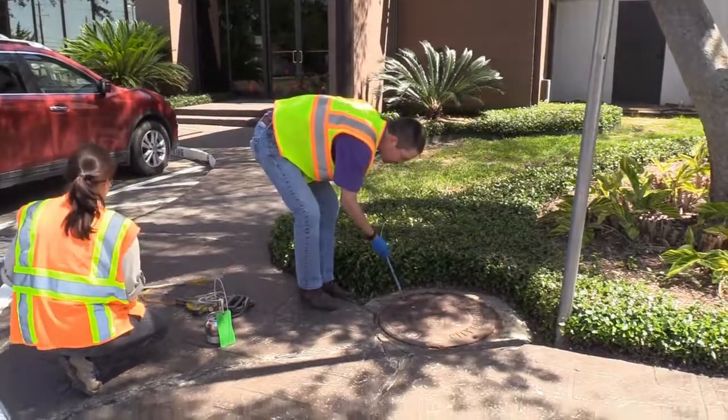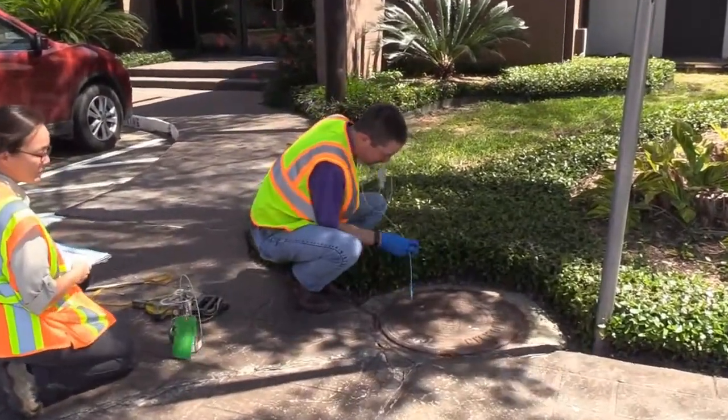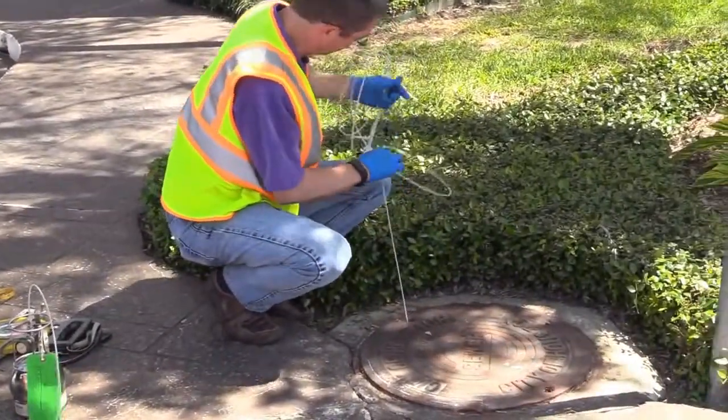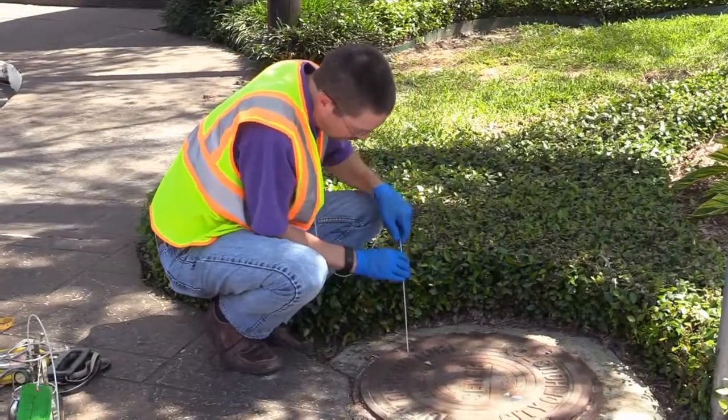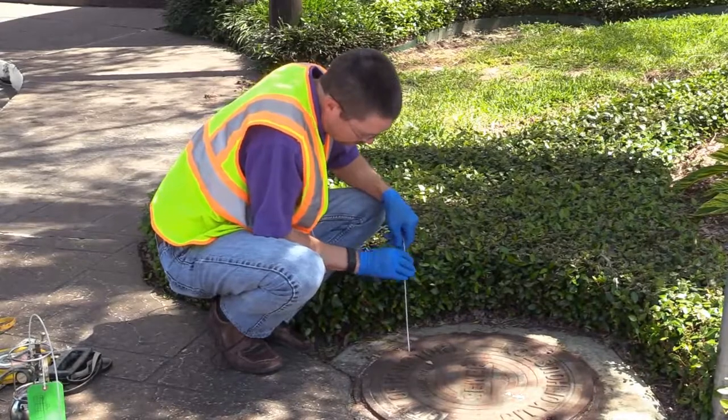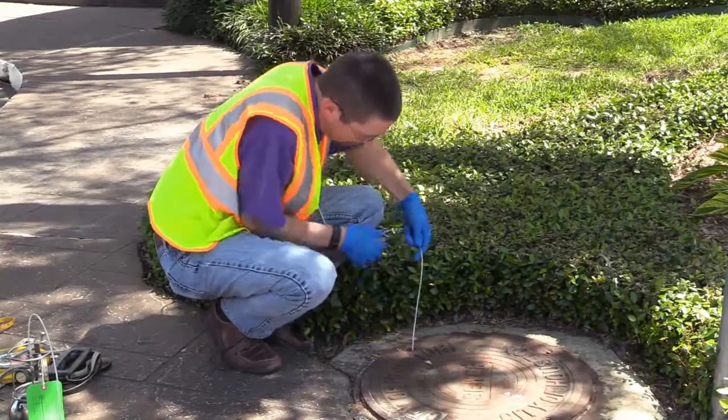To collect the sample, lower a weighted sample line to the target depth. For a manhole with minimal liquids, the bottom of the manhole can be identified using the weight to feel the bottom. For a manhole with standing liquids, the target depth can be marked on the sample line.